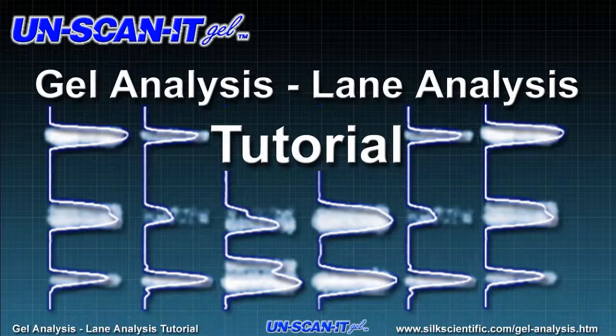Welcome to the Gel Analysis Lane Analysis tutorial for the Unscan It Gel software. This tutorial will step you through the gel analyzing process using the Unscan It Gel software. This tutorial will show you how to use the lane analysis mode of the Unscan It Gel software to analyze lanes and bands on electrophoresis gels.